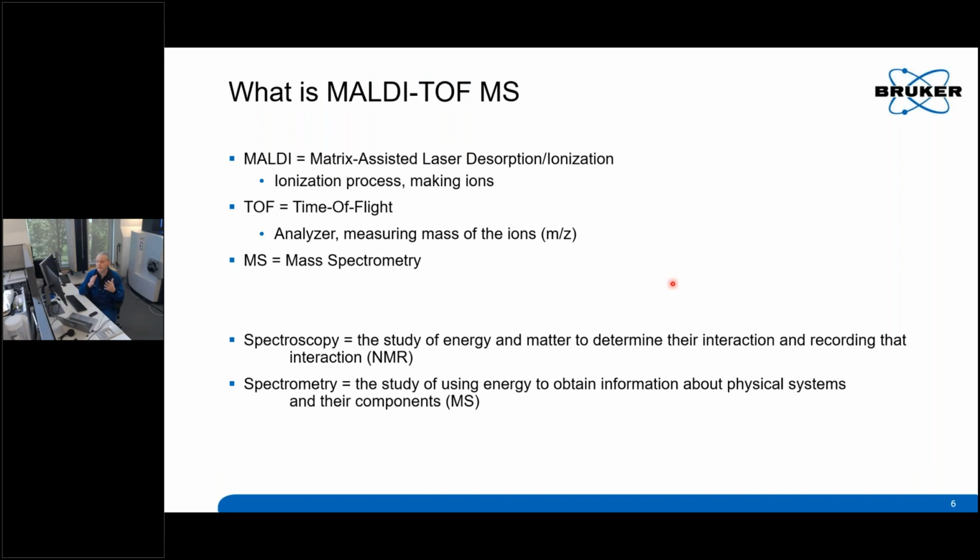So now we're going to go into some definitions. When I finish this presentation, you may not remember everything, but at least we'll all be speaking the same language, since I don't know everybody's background that's in attendance today. So MALDI is matrix-assisted laser desorption ionization. This is the ionization process. This is where we make ions.